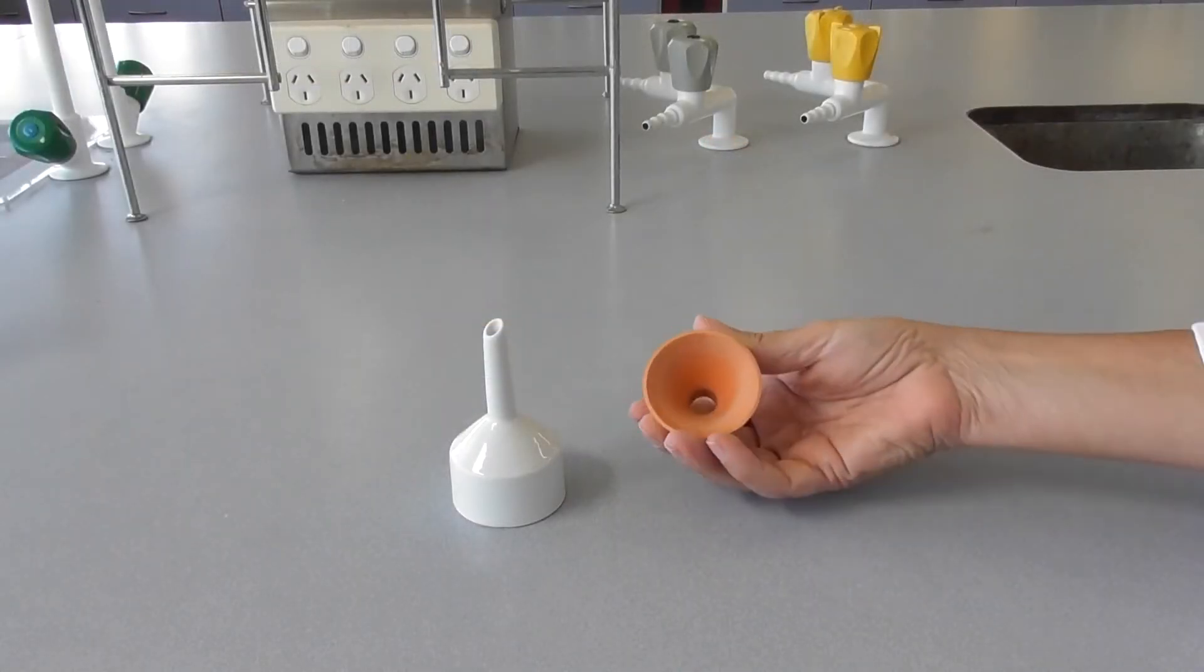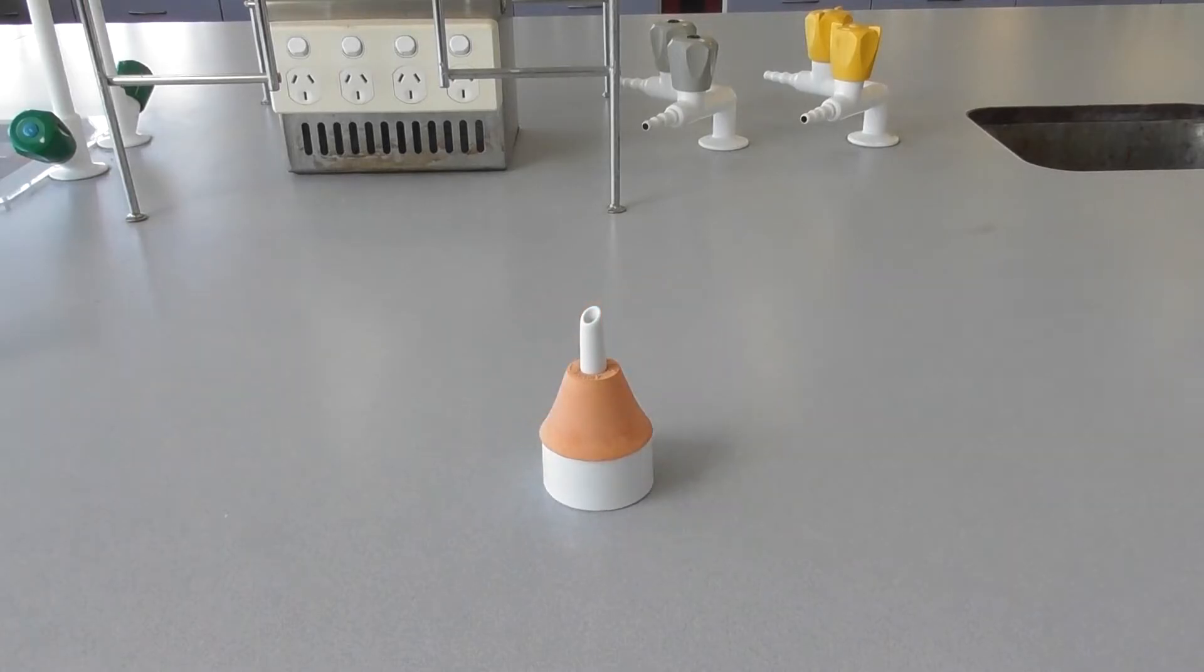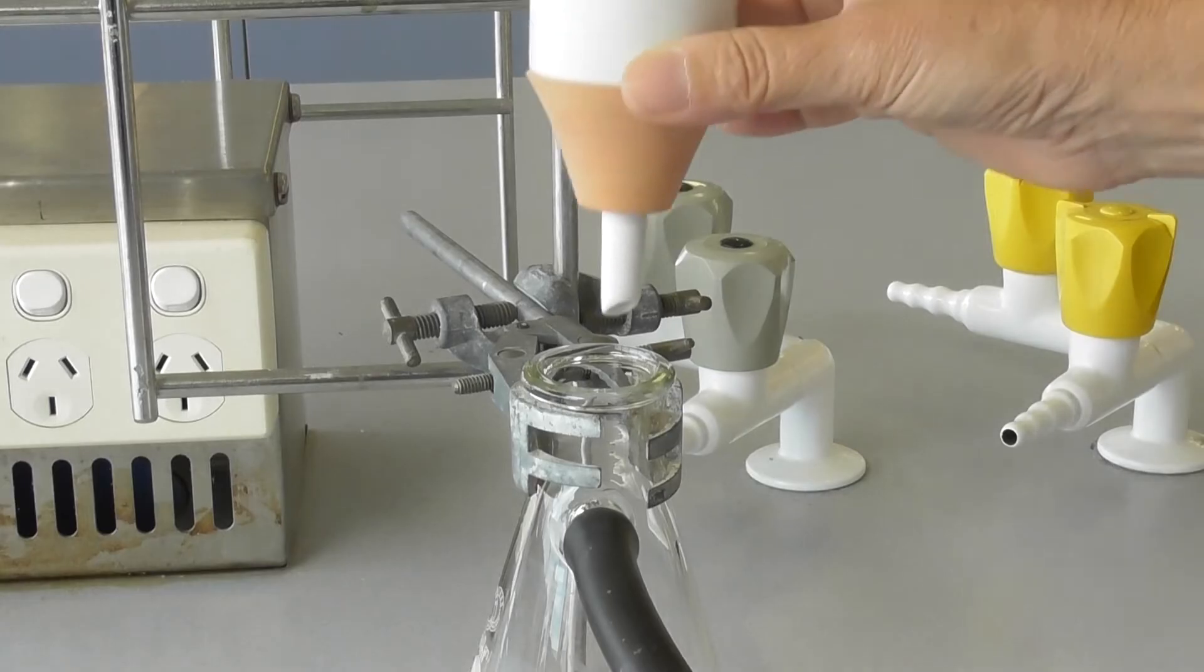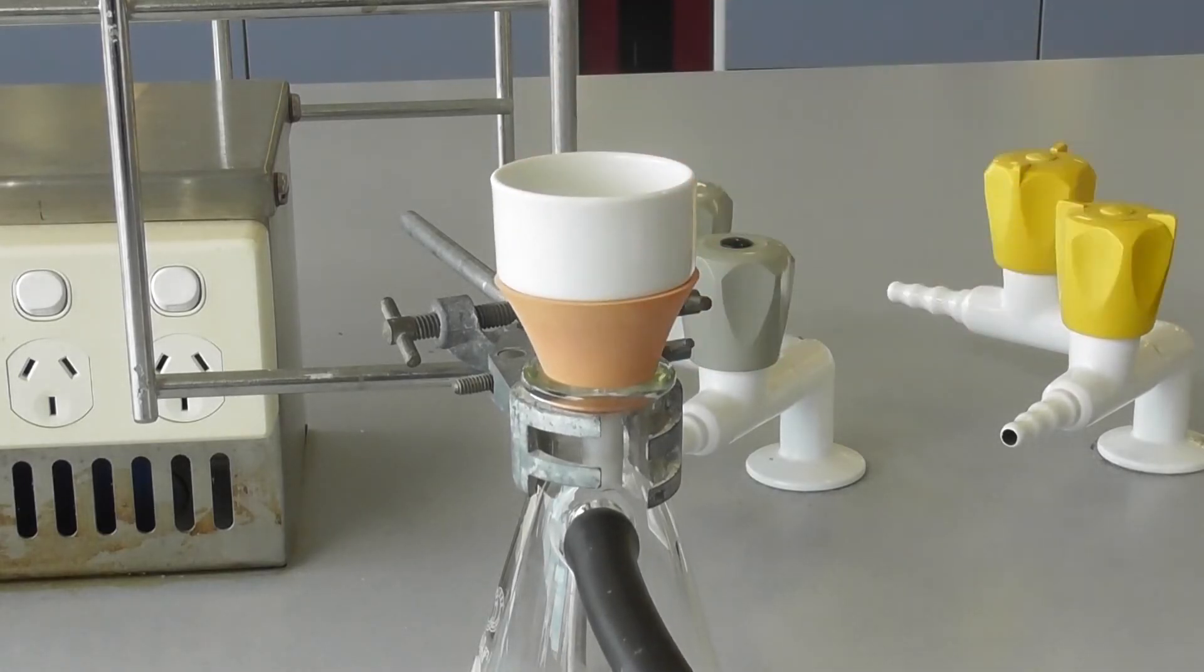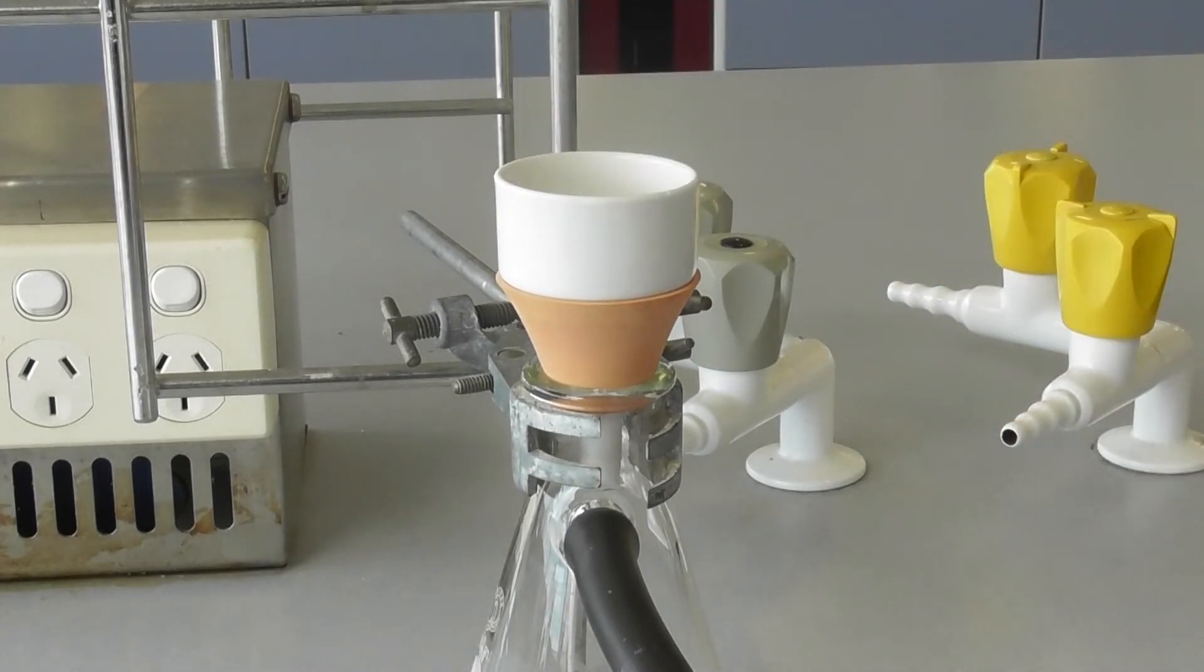To create a vacuum seal with the Büchner flask you must fit a rubber cone to the bottom of the Büchner funnel. Insert the Büchner funnel into the mouth of the Büchner flask. This fit may initially be loose but as the vacuum is applied the seal will form.